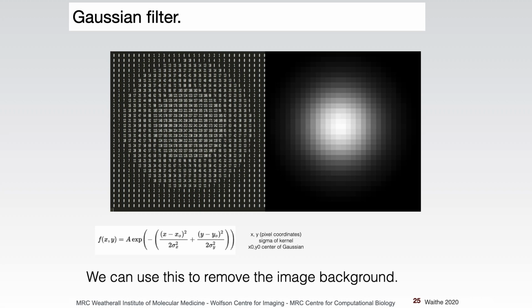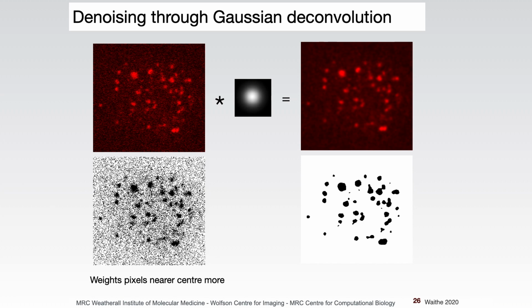And it's very typical to smooth with this filter before doing any edge filters and things like this, because it just smooths your image, and then the edges become more pronounced. So when you apply those techniques, it's easier to see the edges as you'd want to. You can see here, this image had the Gaussian applied to it, and now it's really quite nice. The smoothing has had a very positive effect on allowing us to extract these features. But of course, maybe you would lose something by smoothing it, so it's not always a good thing to do, but depending on what you're trying to analyze, it can make life a lot easier.